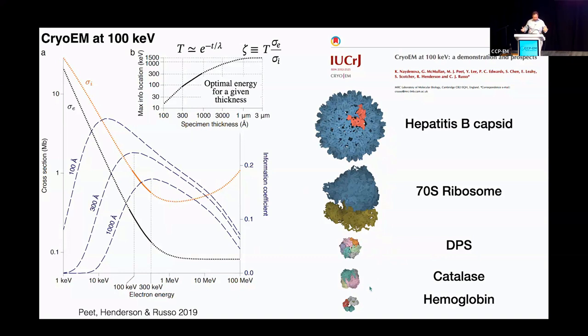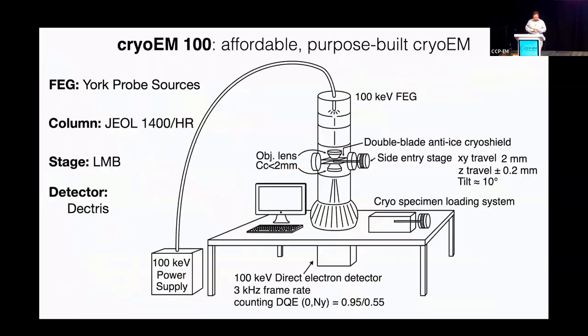And so we said, let's do this. Let's have a 100 keV microscope. And we, of course, went to all the microscope manufacturing companies and told them this, and not much happened, I have to say. We do what you do when you're in this situation. We said, okay, we're going to have to do this ourselves. And so this was the cartoon that we put into the grant proposal. As you also do when you write a grant proposal, you have to have a cartoon.